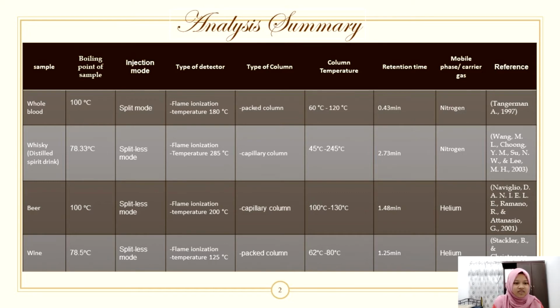And next is the retention time. We can see the lowest retention time is for whole blood with 0.43 minutes, while the whiskey has the highest retention time with 2.73 minutes.